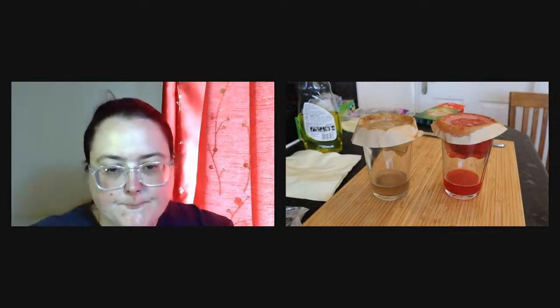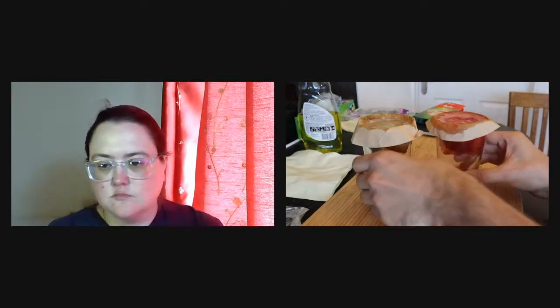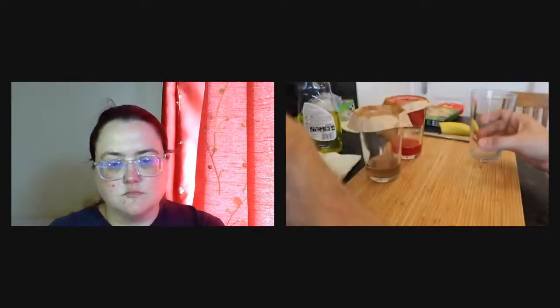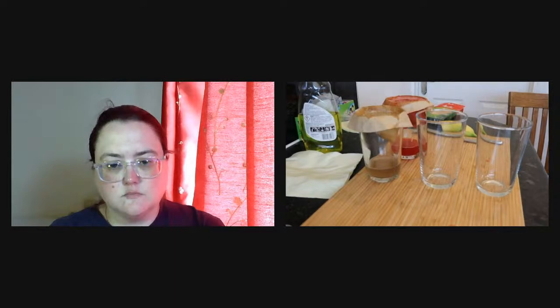So what's going to come next is you are going to need 2 clean glasses again. So I'm going to put those on the side, and I'm going to pick 2 clean glasses and put them in front of the camera. This is what we have here. And I'm going to go and get my isopropanol from the freezer.